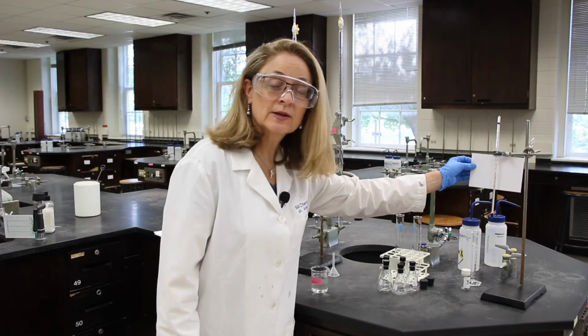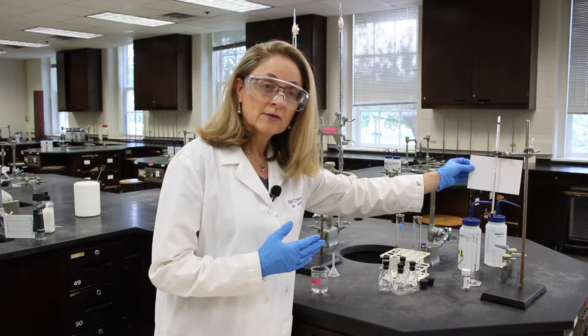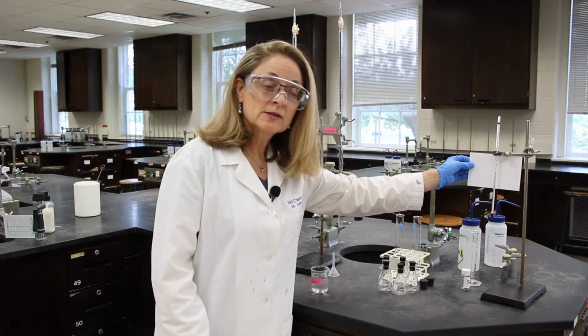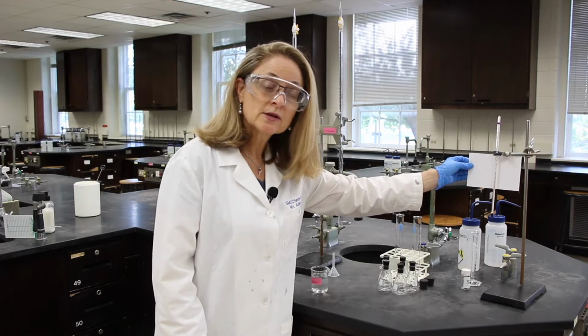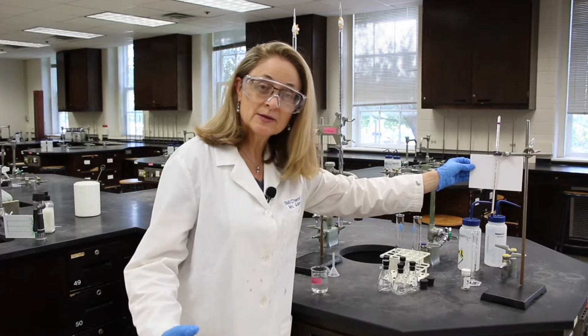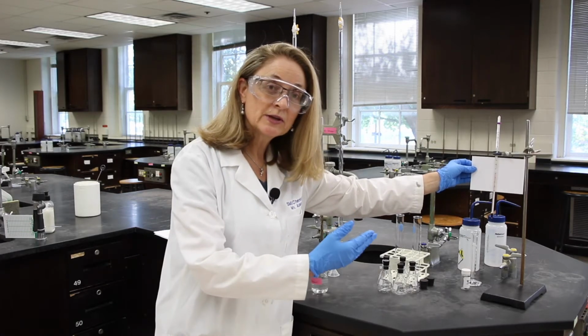I'd like you to read this. This thermometer is 0 to 100. The smallest division is in ones, so we'll read to the ones and estimate to the tenths. Please read this thermometer.